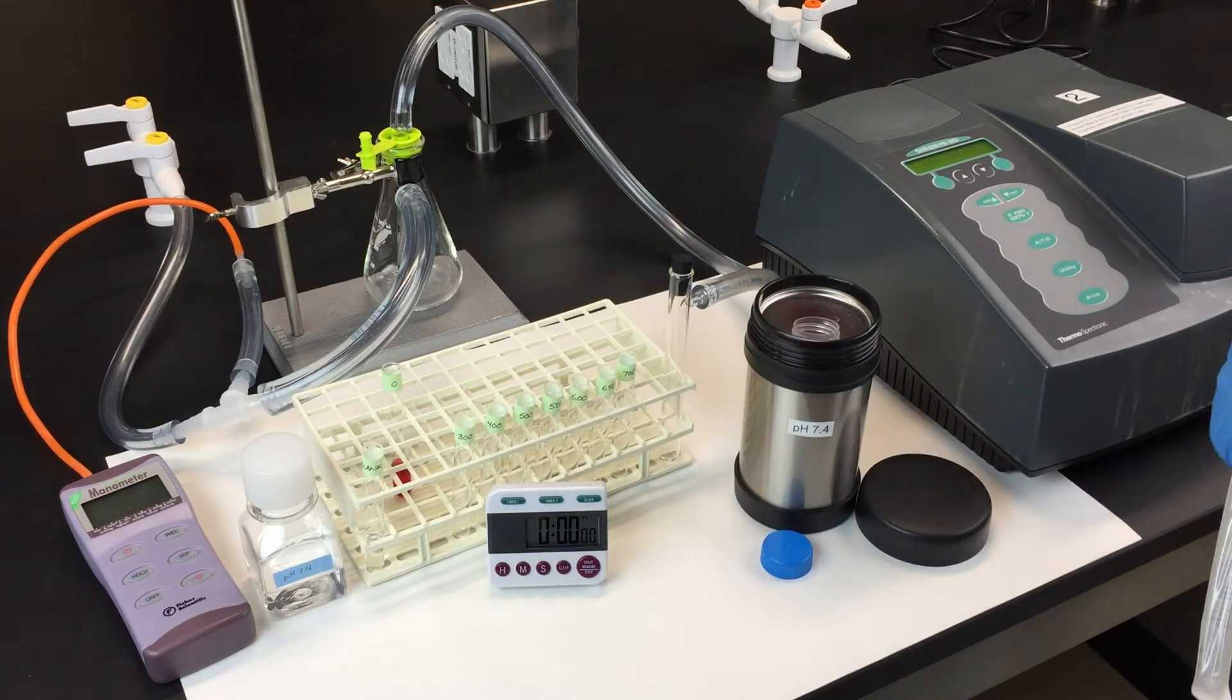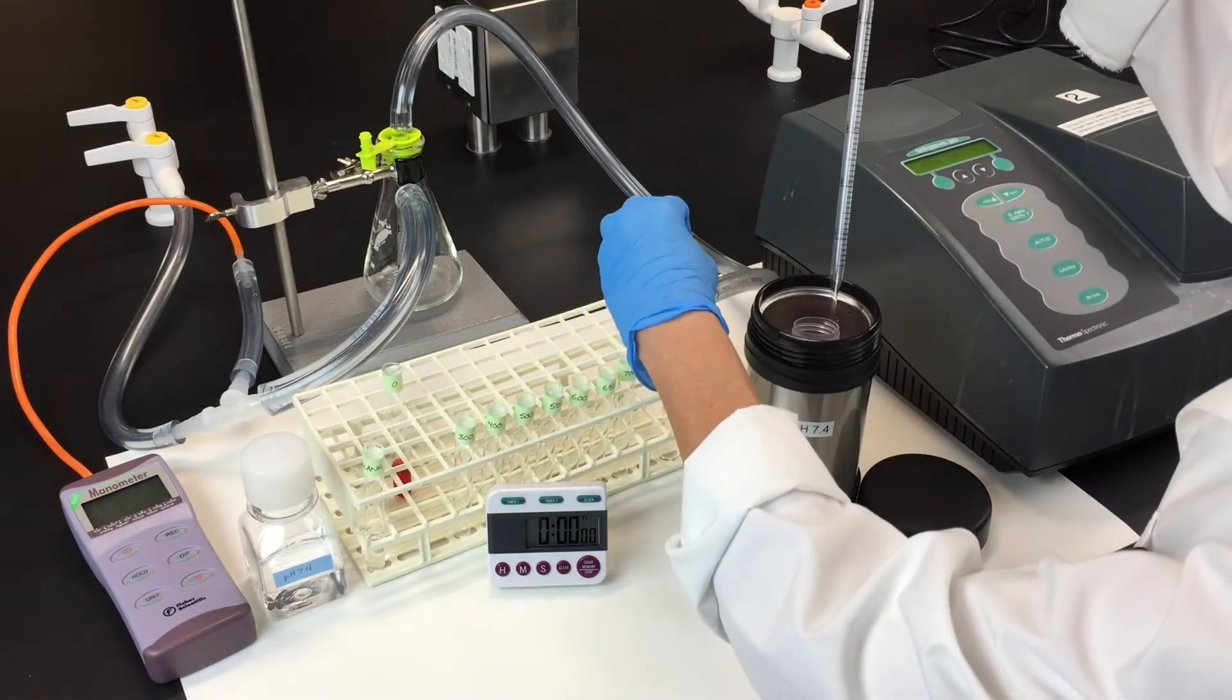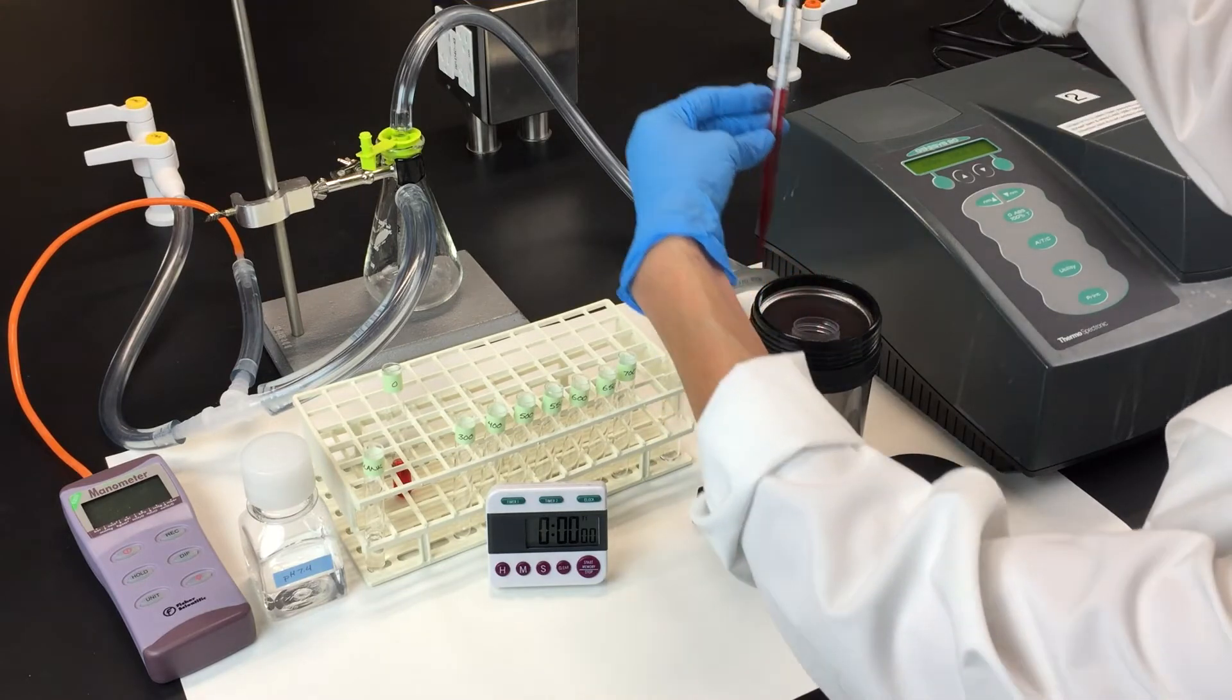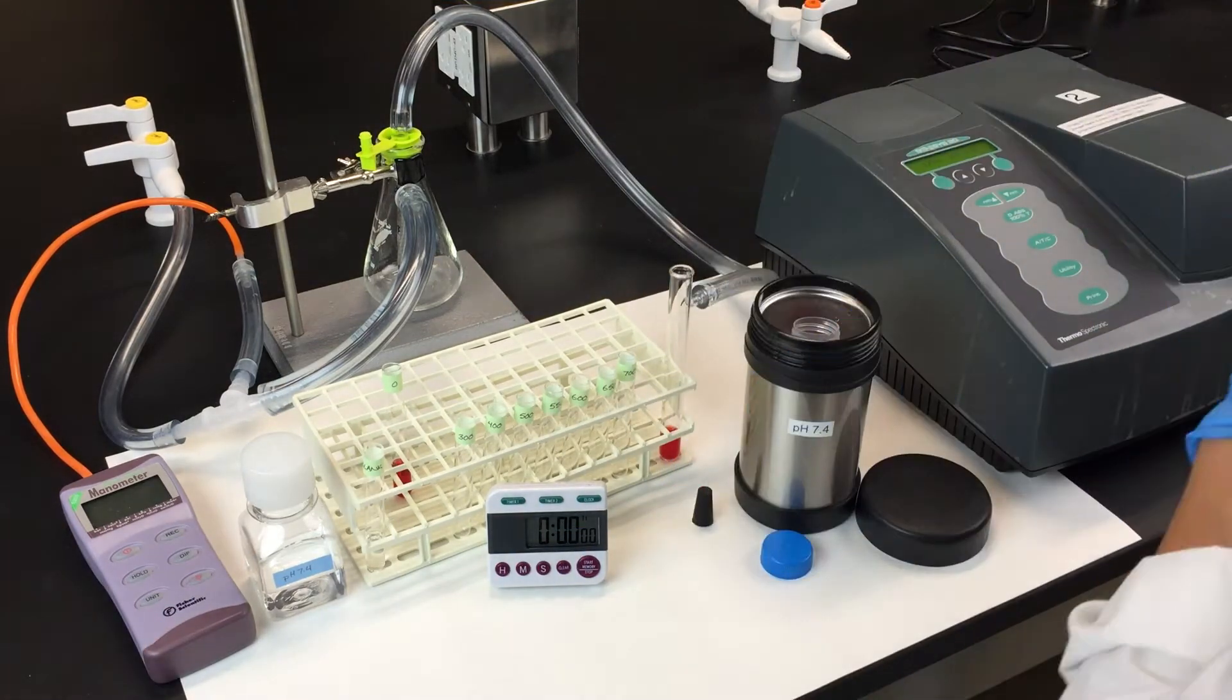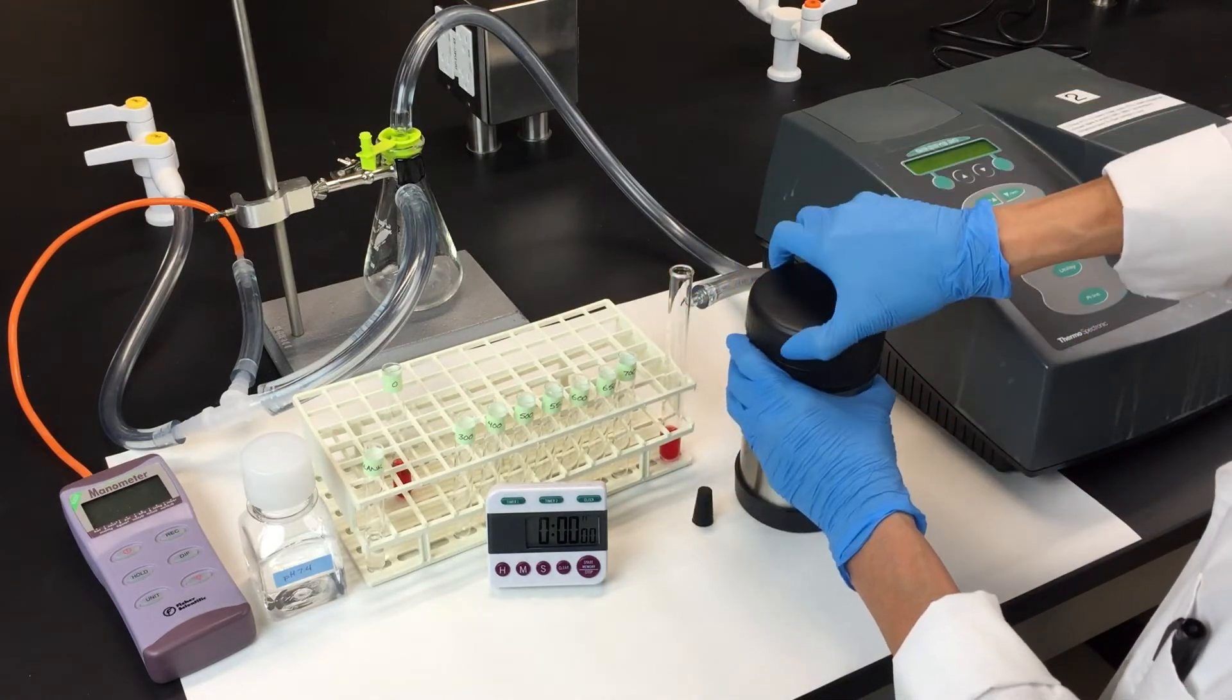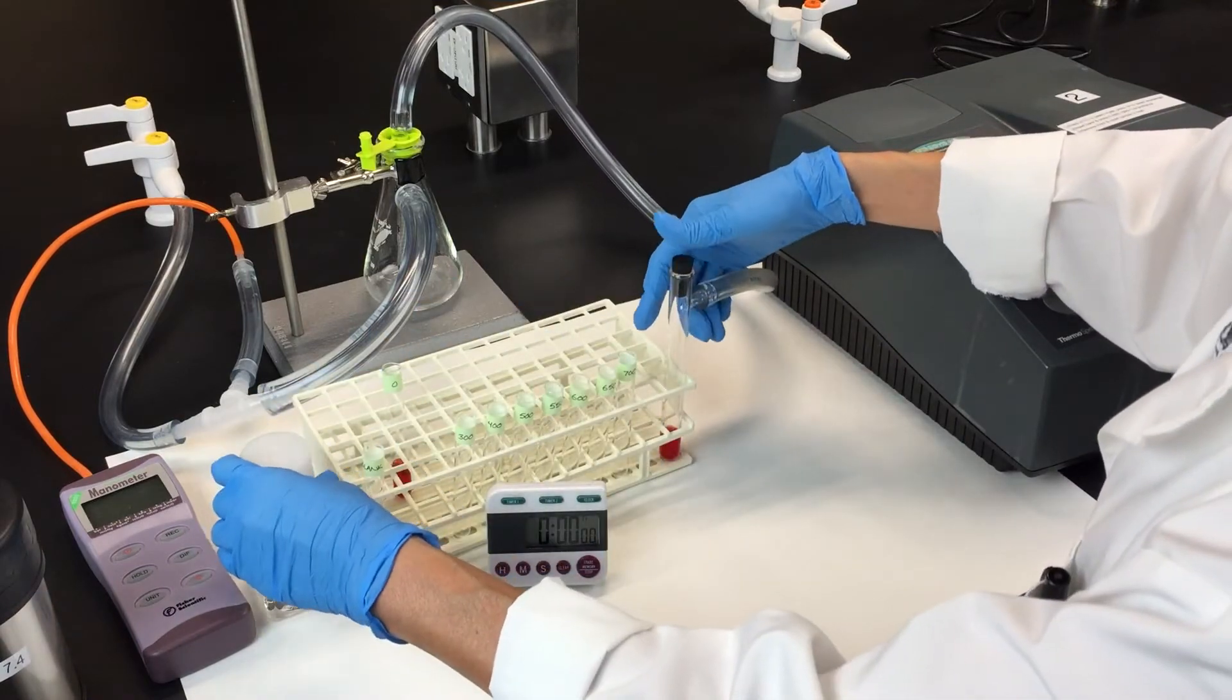Place 2.5 milliliters of hemolysate in the sidearm tube that's attached to the vacuum system. Place the rubber stopper in the top of the tube to seal the system.